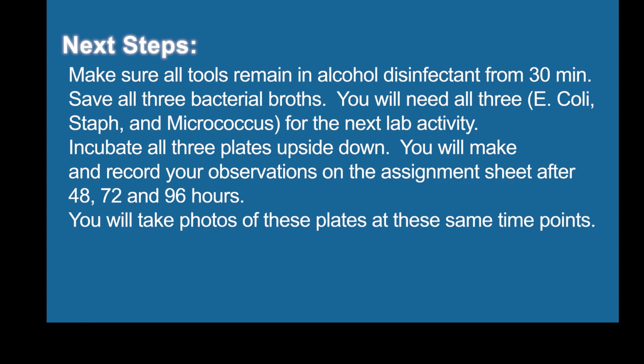I'm going to make an additional video to talk about the results of each of these plates to make sure you understand what the results that you see mean and how you can successfully interpret each of your plates.